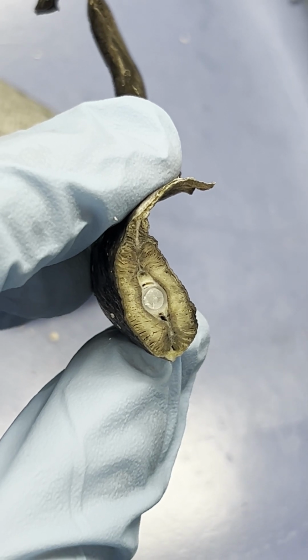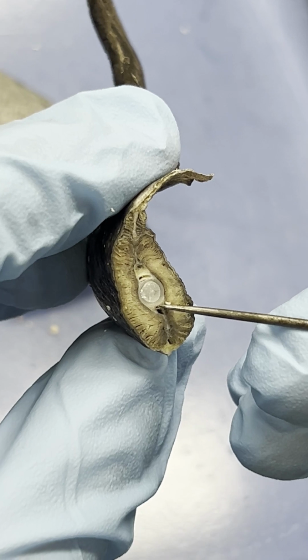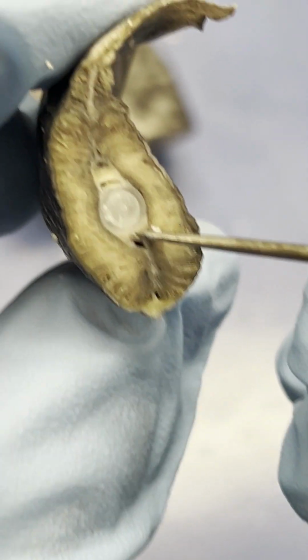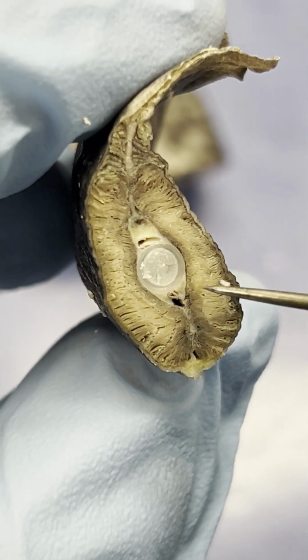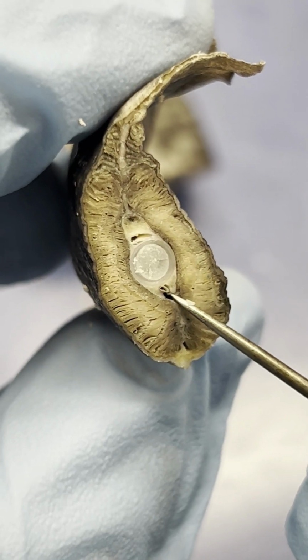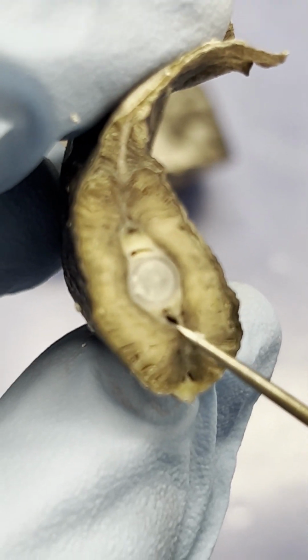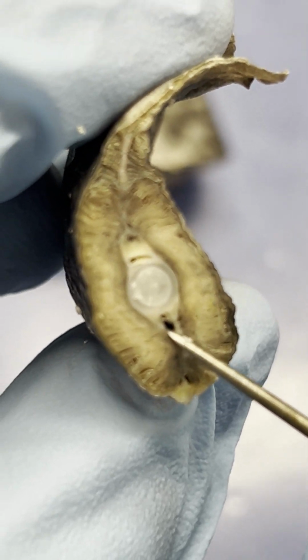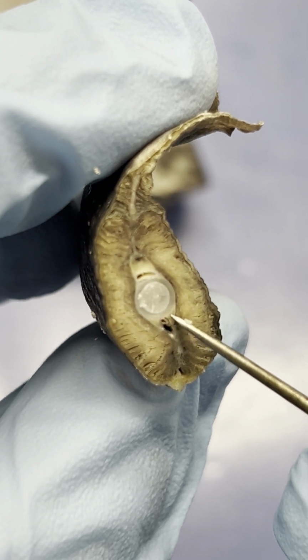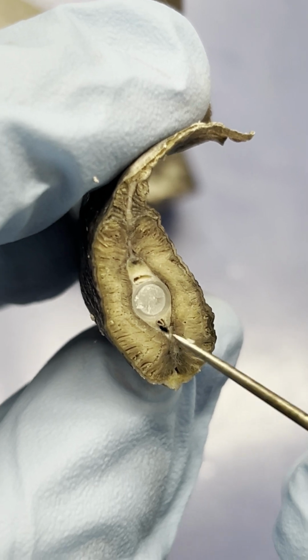We have the caudal artery, which is going to be this very tiny opening right there. Looks like Dr. Mick is finding the opening. The larger opening, ventral to that, is going to be our caudal vein. So the caudal vein is the big opening right here. The caudal artery is going to be dorsal of that, extremely tiny, right above the caudal vein.